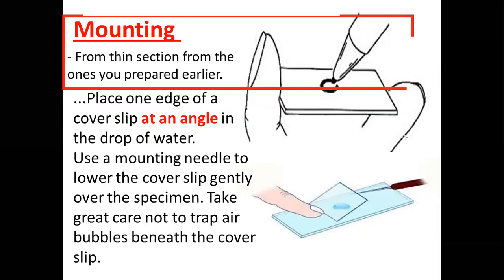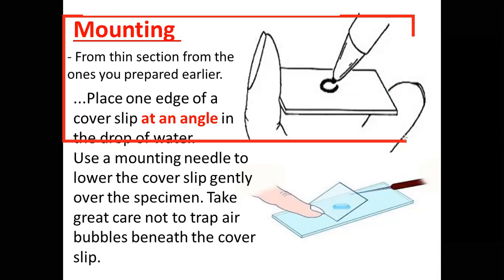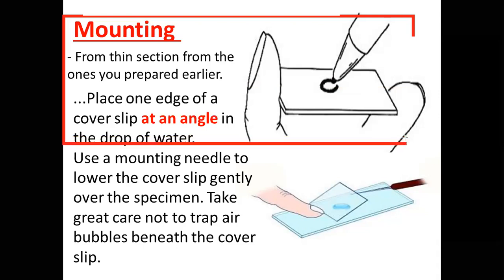It can actually flow out of the slide. We do it on a flat bench. Even if you hold it with your hand, it can be a bit dicey. Okay, fine, you can, but we make sure that it is flat, so horizontal.